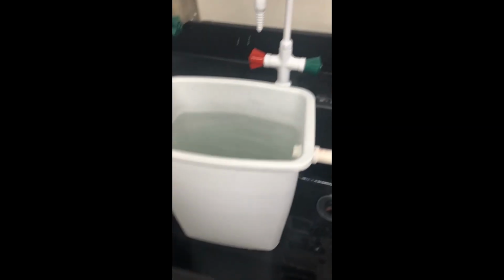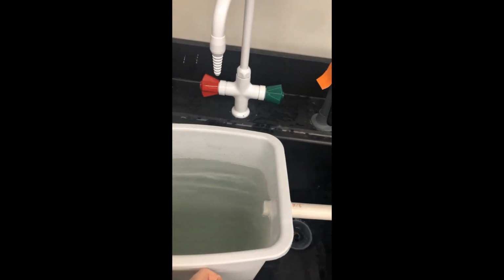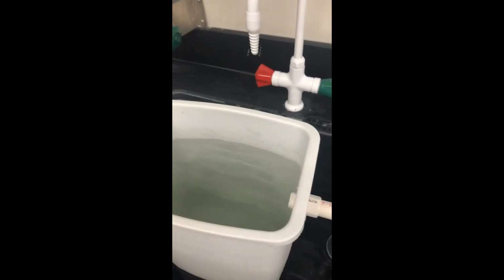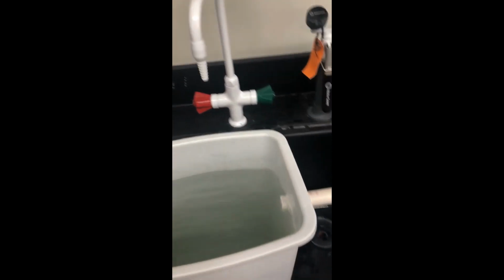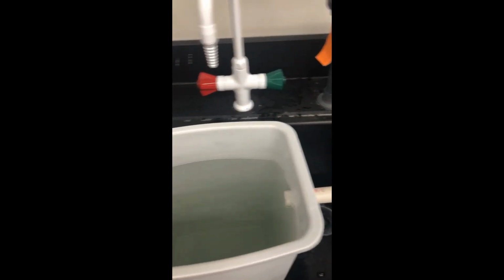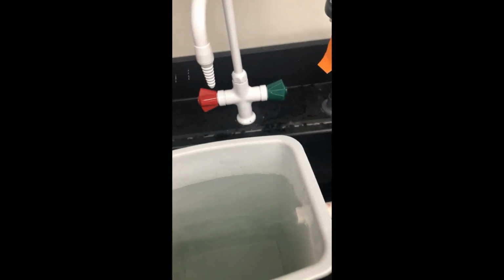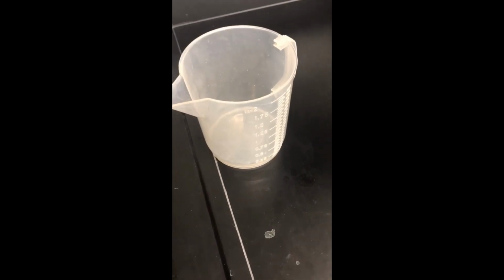So there's two ways this could go wrong. One, if this bucket isn't completely full, then the water won't start coming out right away, so that could impact the volume of the balloon. Another thing is if as I'm submerging it, I accidentally put some of my hand in there, that would cause more water to come out, and that would mess up the volume of the balloon.